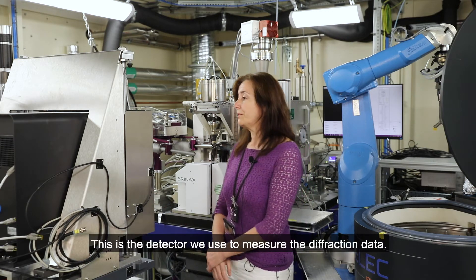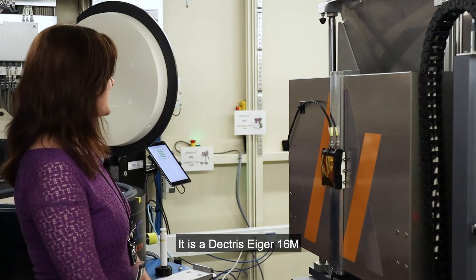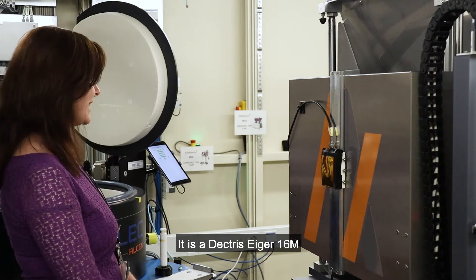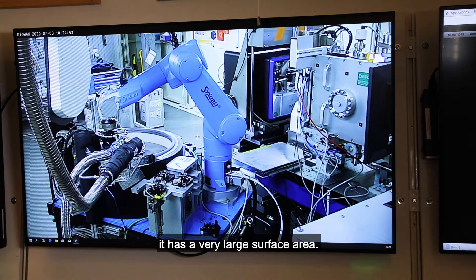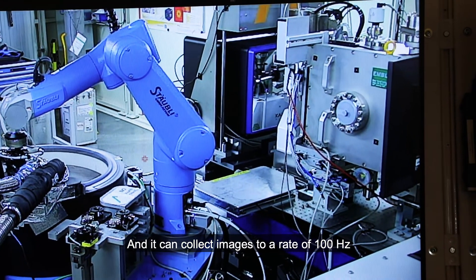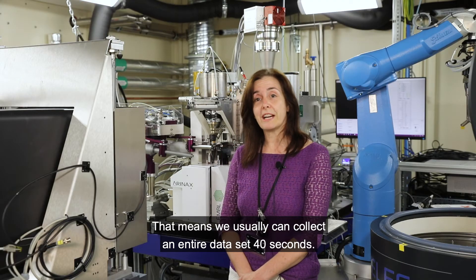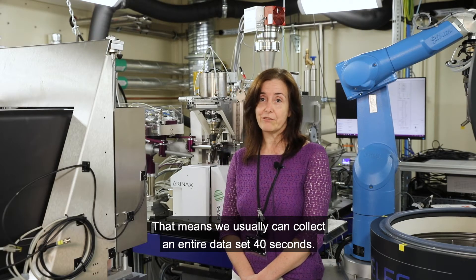This is the detector we use to measure the diffraction data. It is a DECTRIS EIGER 16M. It has a very large surface area and it can collect images at a rate of 100 Hz. That means that we usually can collect an entire data set in 40 seconds.